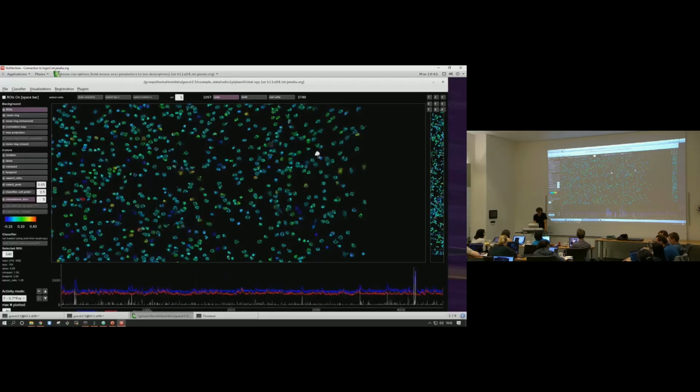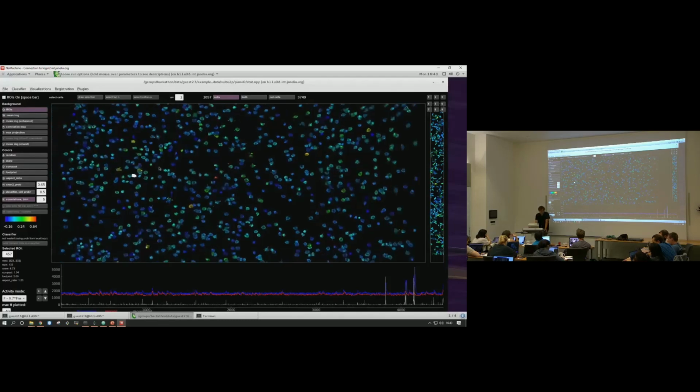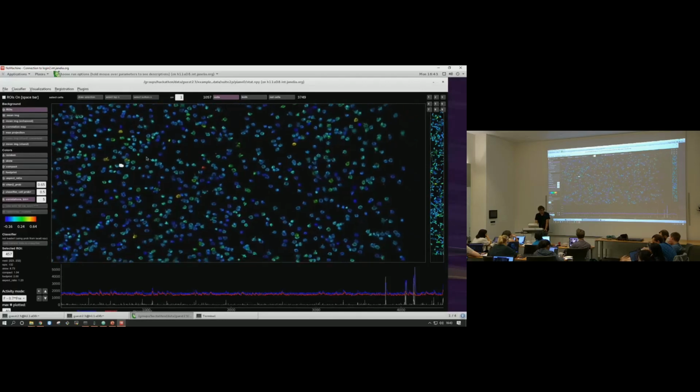This is doing visual stimulation, and this is in V1. So cells are retinotopically matched. This is natural images, I think. Okay, it's natural images. Anyway, my point is that most of what the cells are responding to... Are you sure?